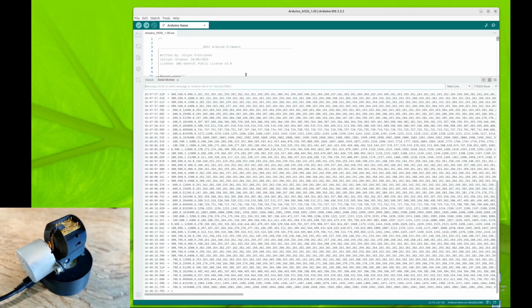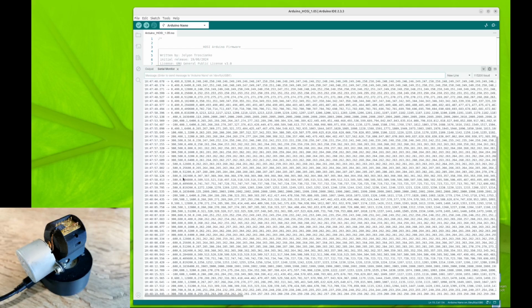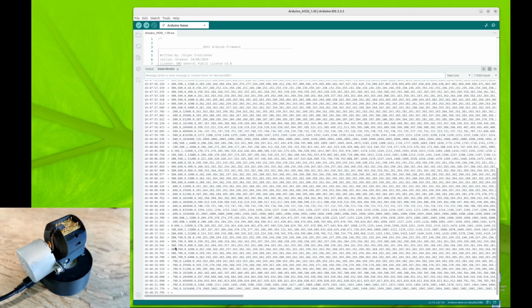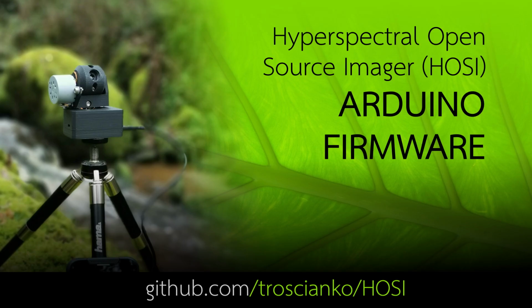And here's the output. You can see it, obviously it produces a lot of output. For every pixel, it's giving you the location in pan and tilt dimensions in steps. Then the 1 and the 0 here, the next one, are telling you what type of measurement it was taking, and the integration time, so whether it's a dark measurement or a light measurement, and so on. Anyway, these are the data that are output, and the graphical user interface will make sense of all that for you. Okay, so there we have a working system.